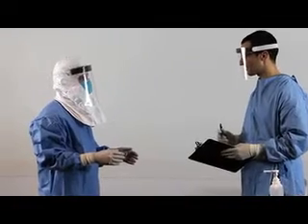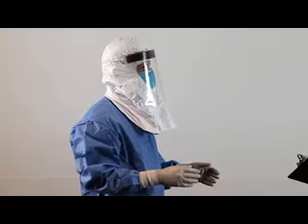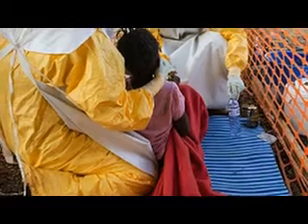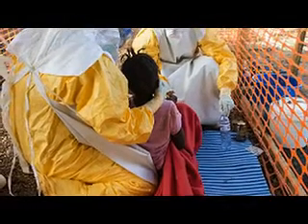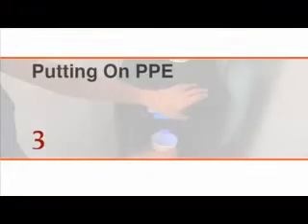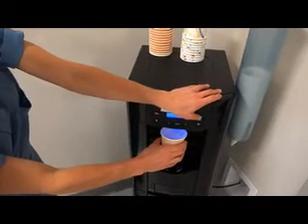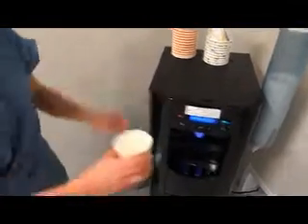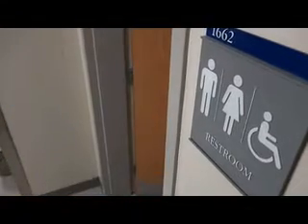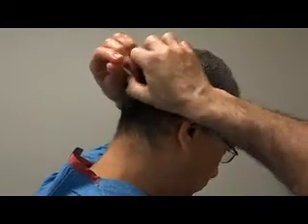The demonstrations in this video show a putting on and taking off sequence for one type of PPE that has been recommended for care of patients with Ebola in United States hospitals. Healthcare settings with limited resources, such as field hospitals without running water or adequate medical supplies, may have different PPE recommendations and protocols. Prior to putting on PPE, bear in mind that you may be wearing your equipment in a potentially warm environment for an extended period of time. To minimize discomfort during patient care, you should be prepared, including using the restroom before putting on PPE. If you wear prescription glasses, make sure they are secure on your face.